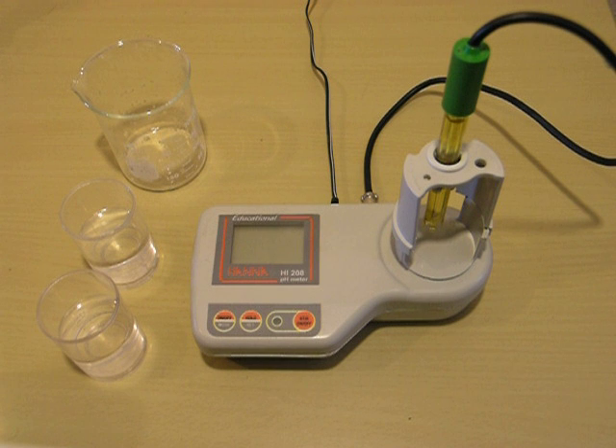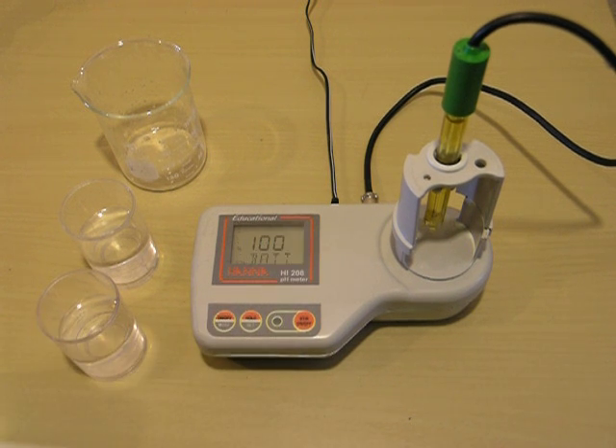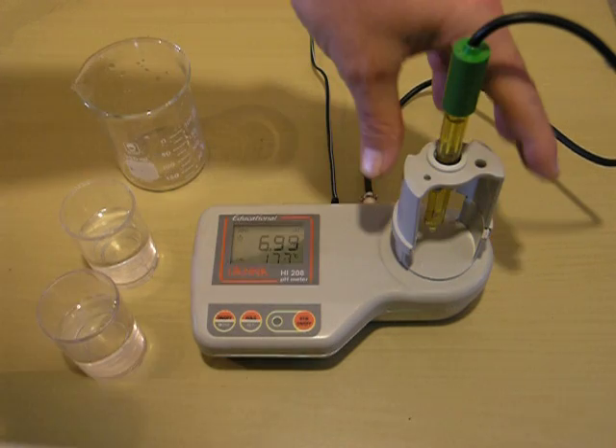I have my probe hooked up. The cap off of the probe has been removed. First thing we're going to do is turn our meter on and let it go through the startup phase. Now we're going to remove our cap.